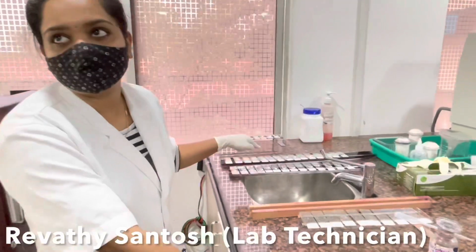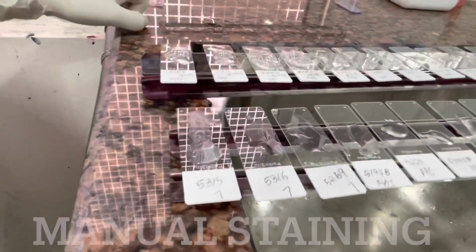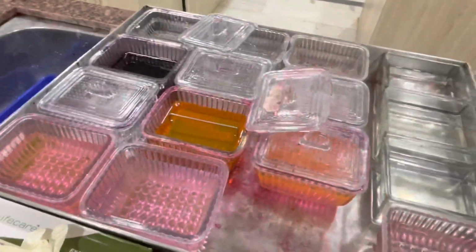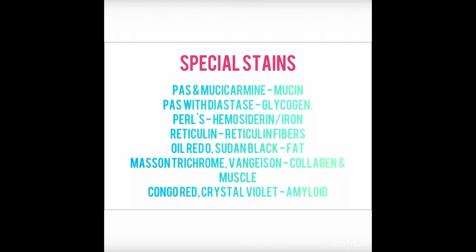Here Revati ma'am is showing us the slides which are stained with PAS or periodic acid Schiff stain and silver stain. All slides that come to the department are either manually or automatically stained with H&E. There are 23 special stains.